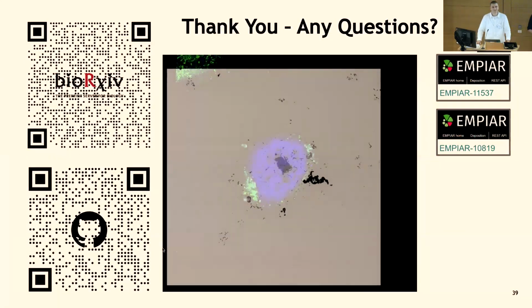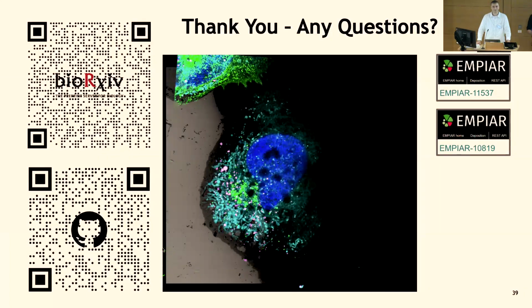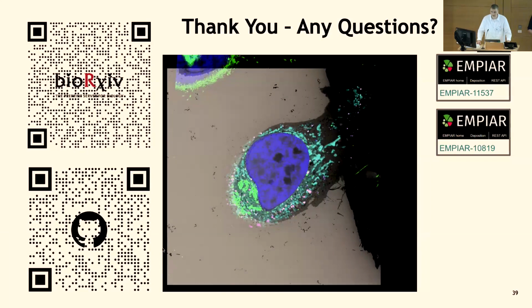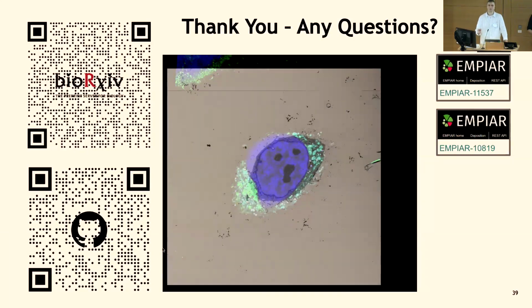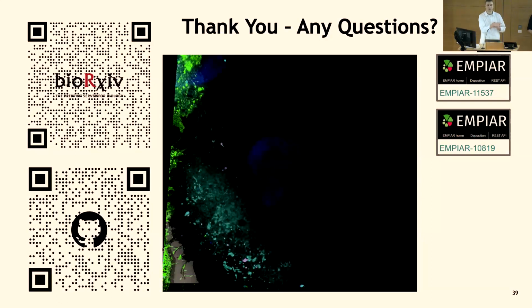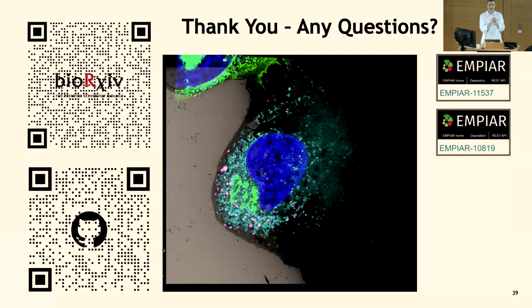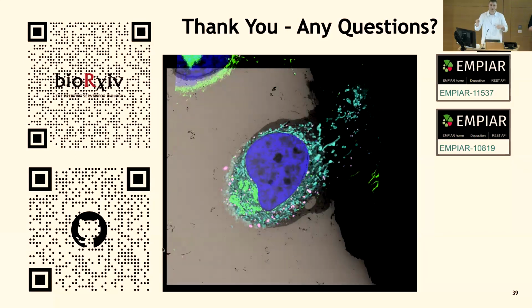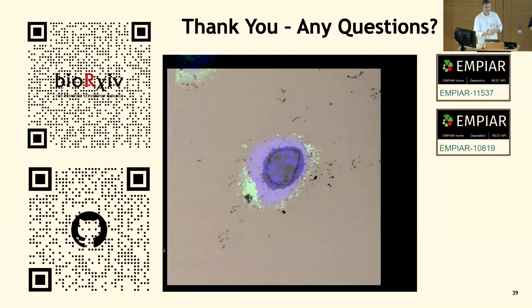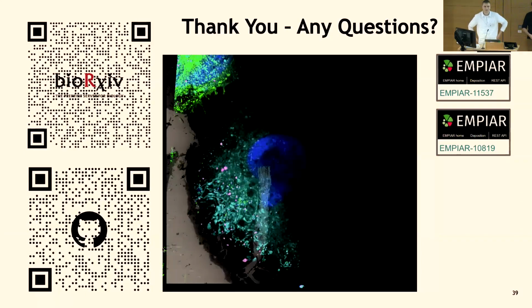And I was also wondering, with the true positive way of measuring success, isn't that quite highly likely, considering that the fluorescent microscopy is much bigger than your EM? Yeah, so the problem with that, because it is just so much bigger, if you were to take into account other equations, for example, it would be punishing it based on the fact that it's bigger. And ultimately we just care about the organelle being encompassed by some fluorescence microscopy, so we can say definitively this organelle is this type from the fluorescence microscopy. There wasn't any properly nice way of quantifying this, but it's the best thing we could come up with at the time.